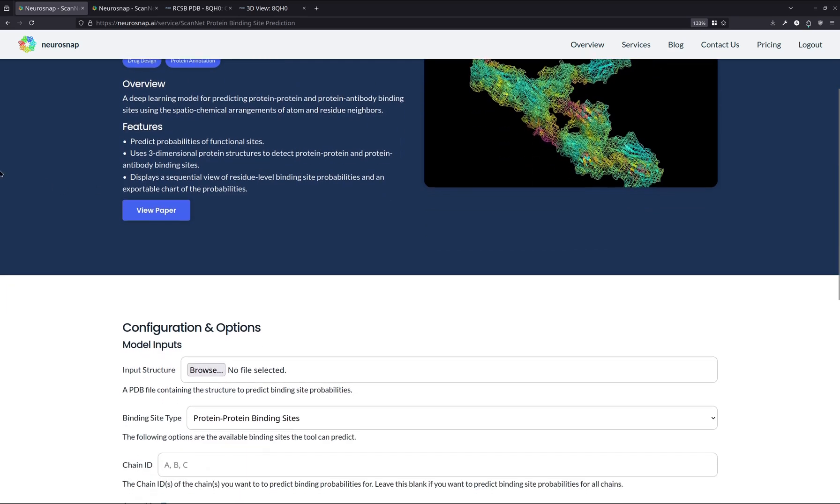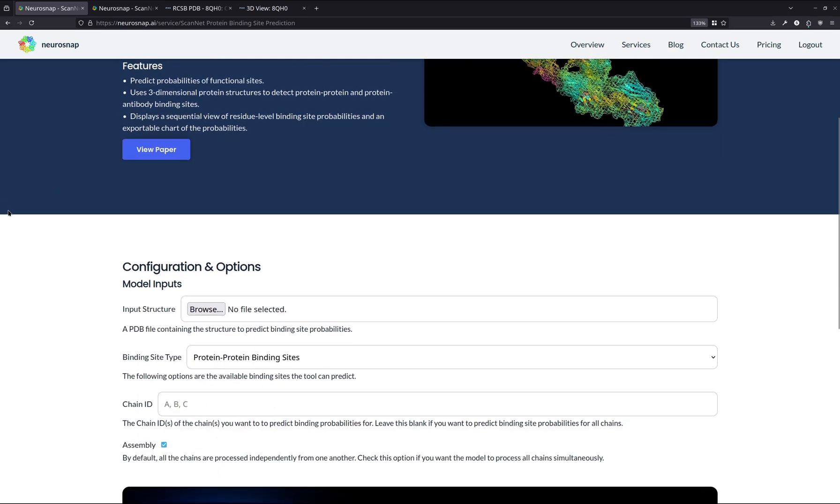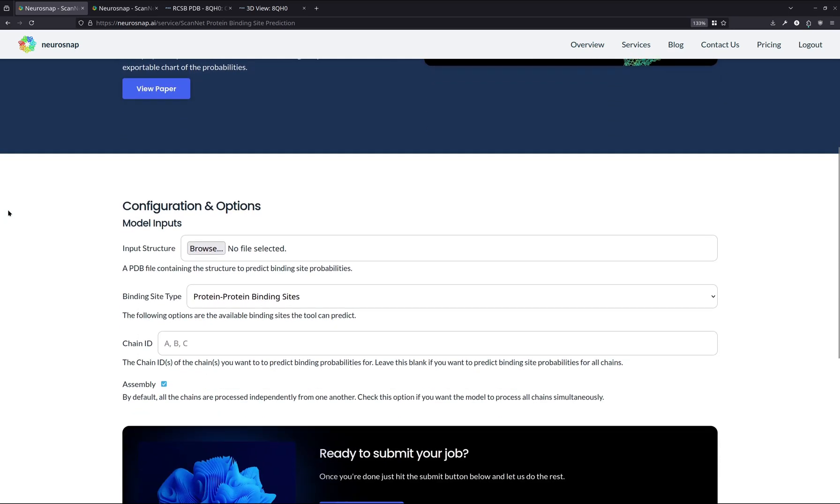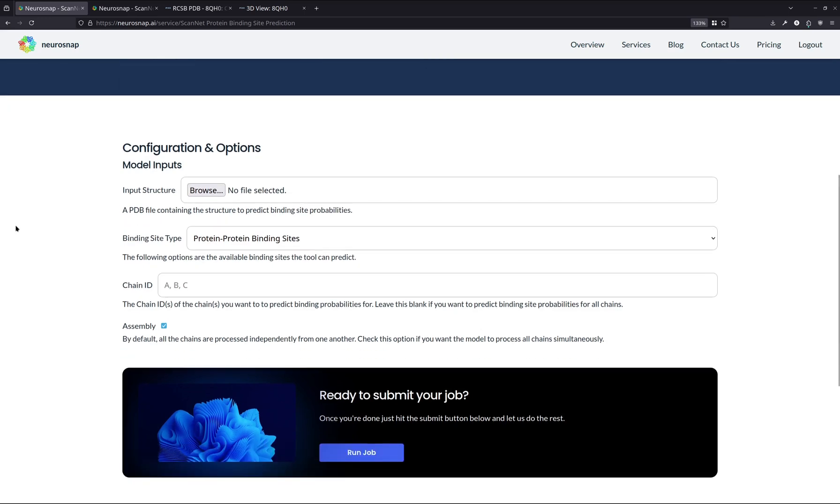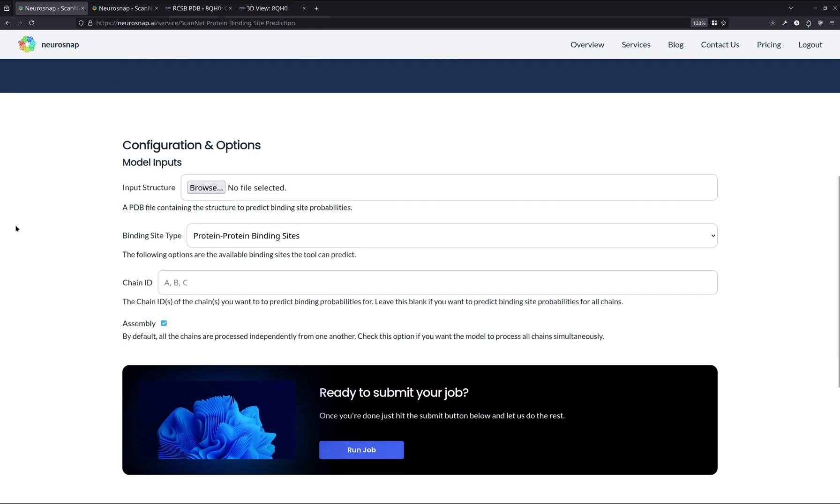ScanNet is interesting in the sense that instead of predicting a three-dimensional structure of the receptor bound to the ligand, we're just going to be predicting which residues actually play a role in these protein-protein interactions. So this is cool as it gives us a somewhat ligand ambiguous way to assess which residues are the most important and play the most pivotal roles in the formation of certain protein-protein interactions.